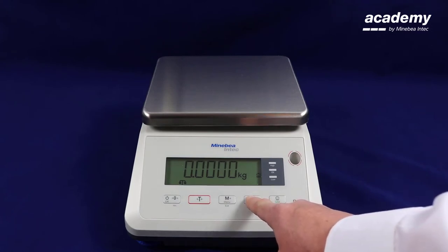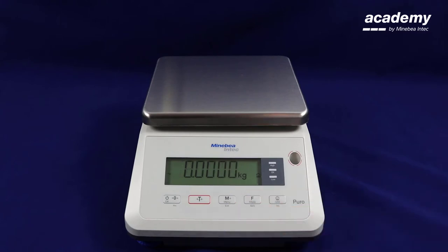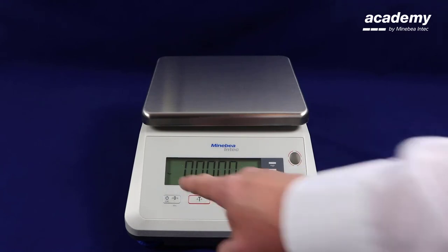Now hold the function key until display hold is shown on the screen. Release the key when you can see the display hold function. The symbol on the screen shows the application is active.